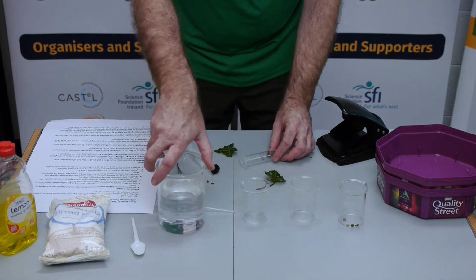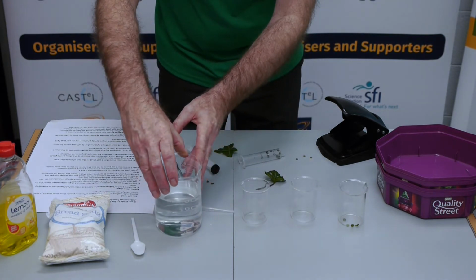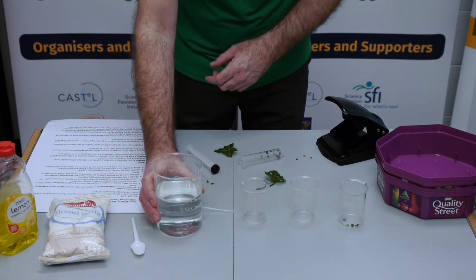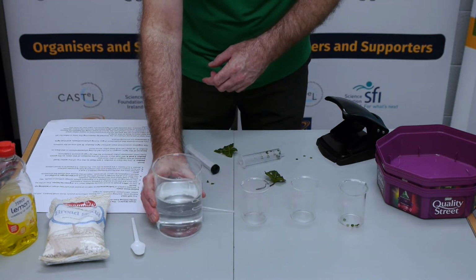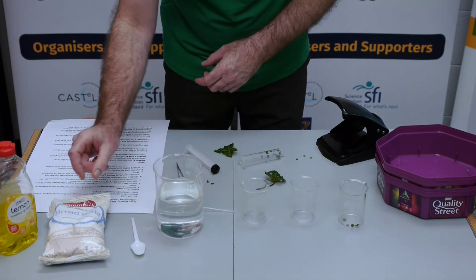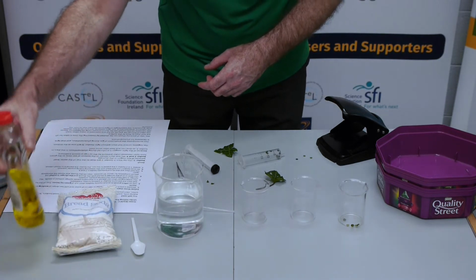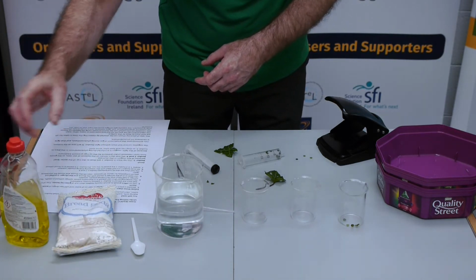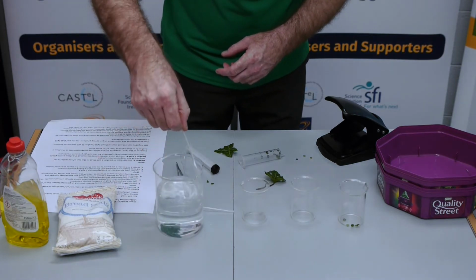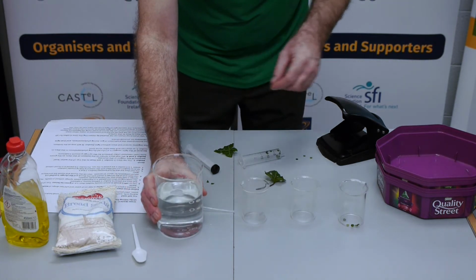Now in the meantime, you need to have a 400 or 500 ml solution made up. It's just lukewarm water, not too cold so that photosynthesis is still going to occur, and just a pinch of bread soda, baking soda, sodium bicarbonate, and a couple of drops of washing up liquid, and stir to dissolve. The sodium bicarbonate provides carbon dioxide for photosynthesis.